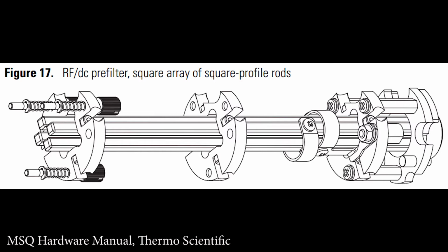We're going to revisit the idea of the quadrupole later, because it turns out you can also use quadrupoles as mass analyzers, not just as ion optics. But let's take a look at a simulation that the Mass Spec Pro did of using a multipole as an ion guide.